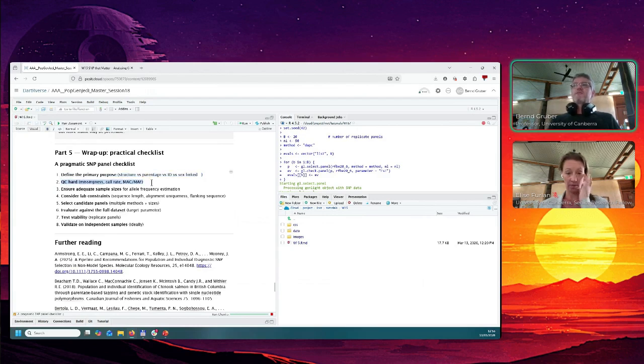Then make sure the SNPs you want to select from are really of high quality, not many missing data, high call rate, occur at least a certain amount of time, and if you can, also use the filters which are linked to a reference genome. So the quality of your hit to the reference genome, and make sure you have the information so you can put in a primer left and right from where your SNP is.